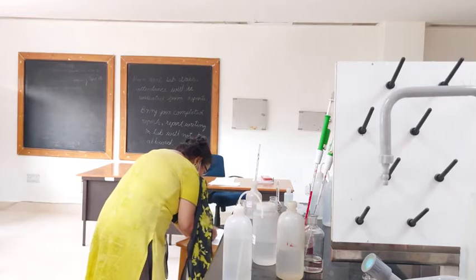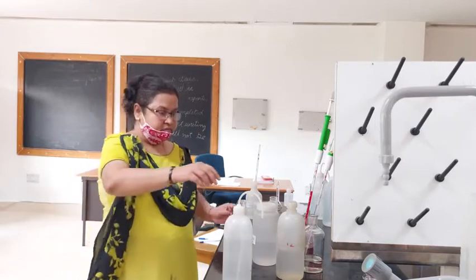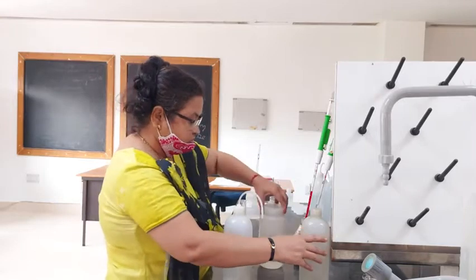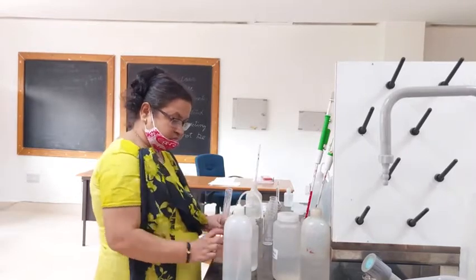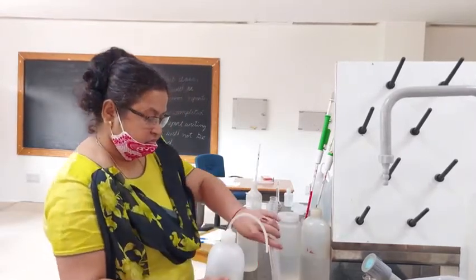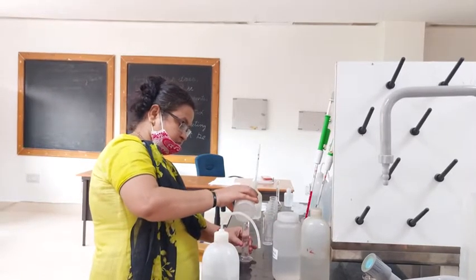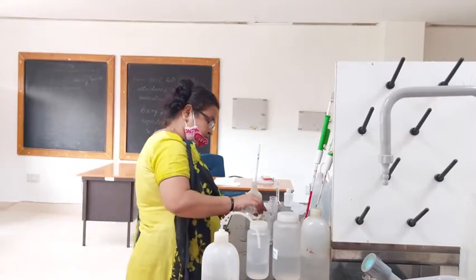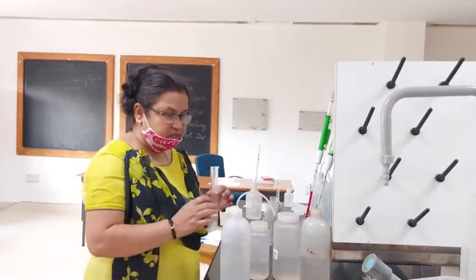Then next is synthetic shampoo. Next is tap water.